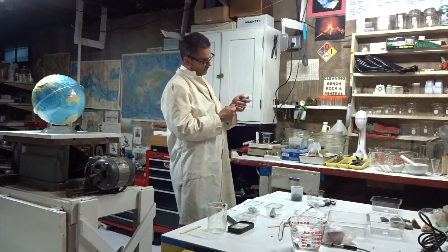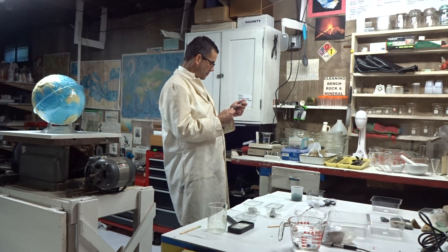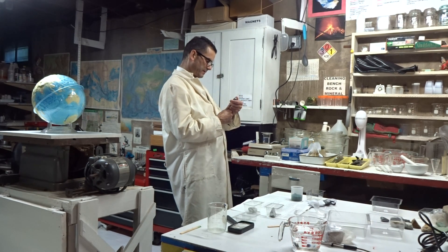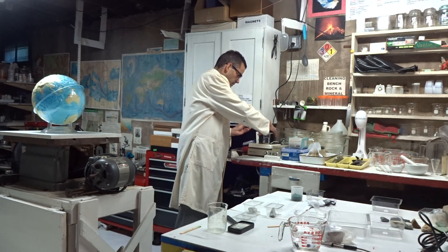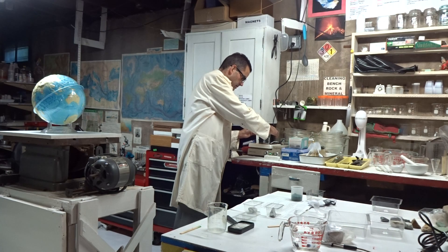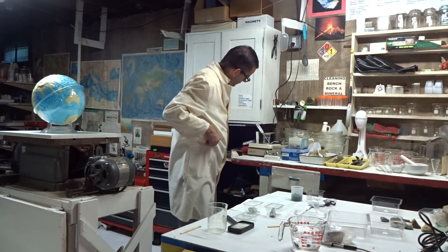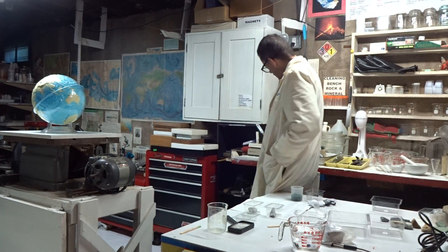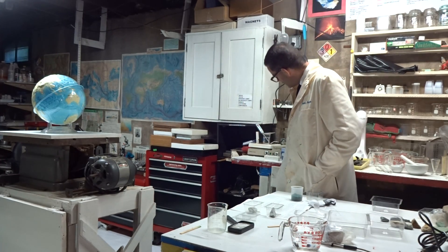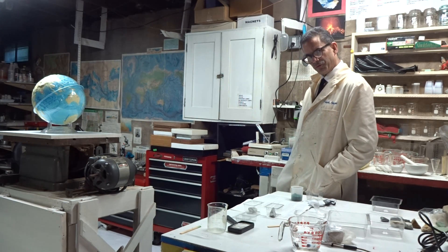This is a thermometer — 72 degrees right now. We've got to get to 212 degrees Fahrenheit. We're at 156, 157 and going up to 212.